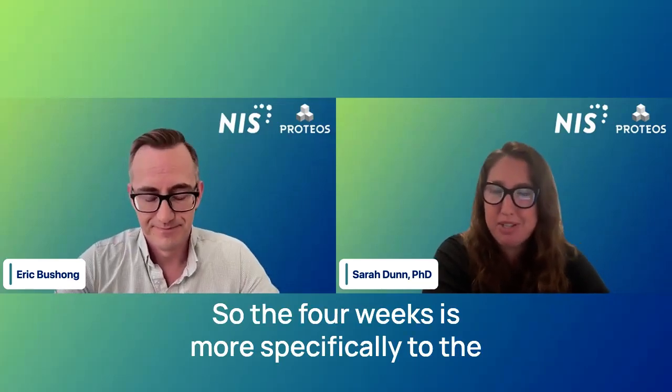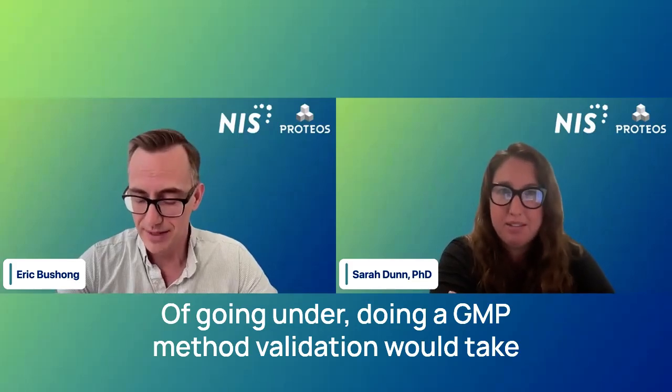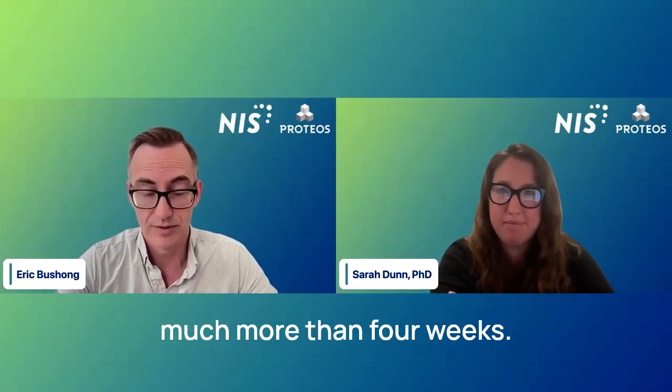Right. So the 4 weeks is more specifically to the routine testing, right? So routine R&D and routine GMP, whereas the actual validation process would be much longer. Yeah, doing a GMP method validation would take much more than 4 weeks, yes.